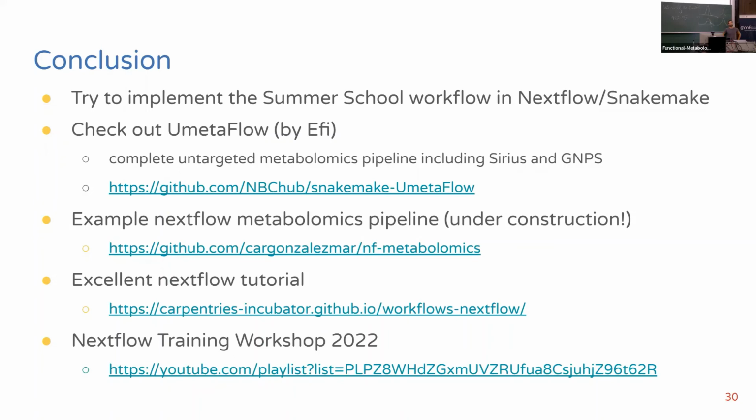We also usually don't change it much in MZmine. If you have something that you want to do downstream, like annotation in Sirius and feature-based molecular networking, it's always going to look the same, adjusted to your instrument and so on. So if you sit down and take your time to make something for the same machine, it's worth your while.